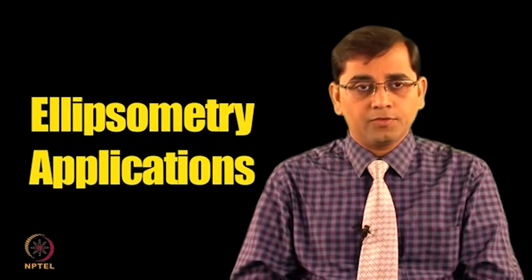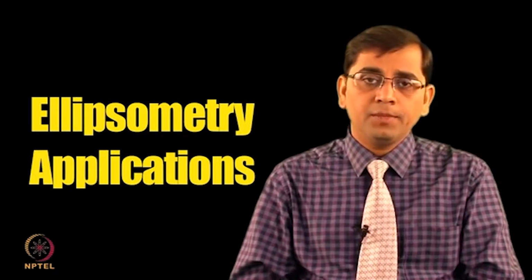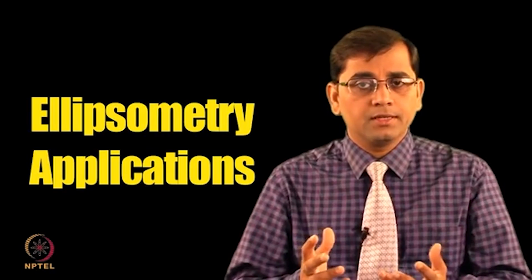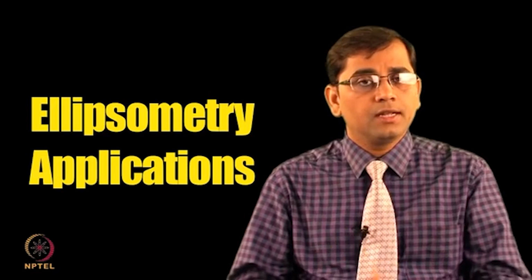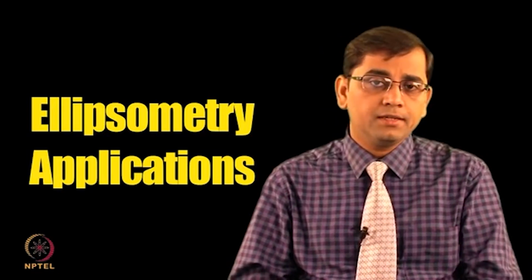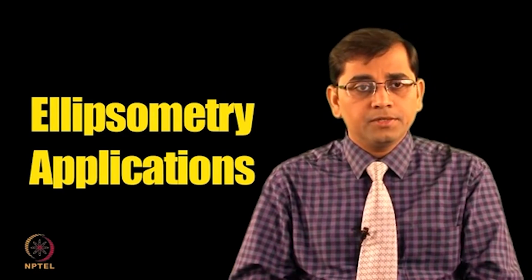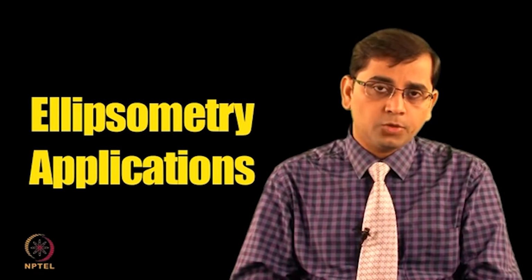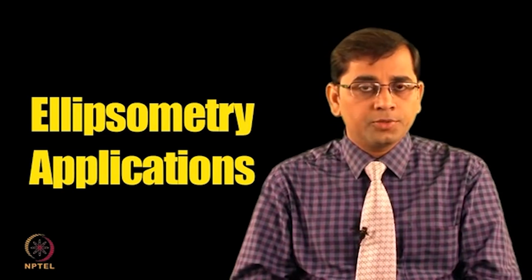Let us now discuss a few applications based on ellipsometry platforms. Ellipsometry has been successfully applied for many applications such as biomolecular interactions, hormonal activity, cell factor, receptor binding, diagnosis for hepatitis B, kinetic measurement of multi-protein interaction processes and quantification of competitive adsorption of proteins.